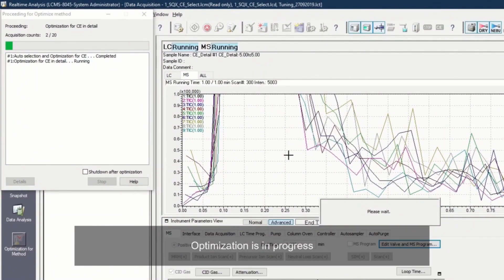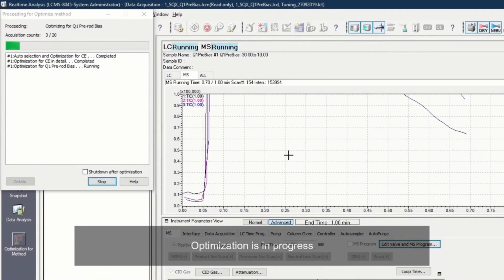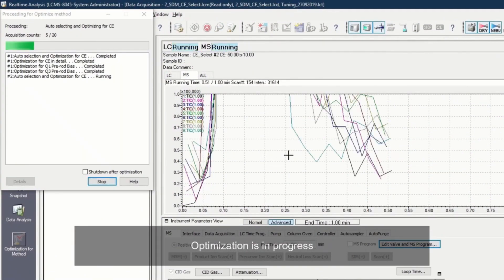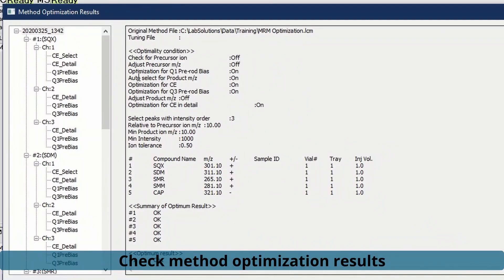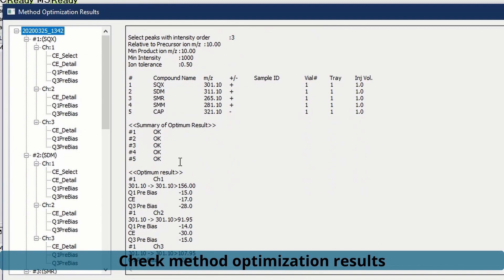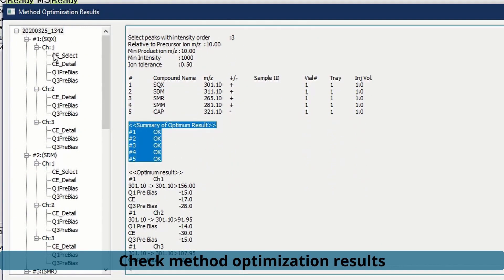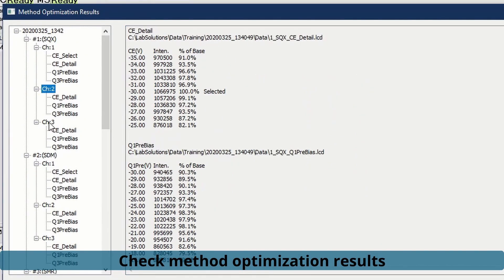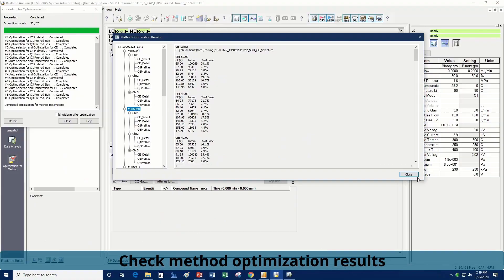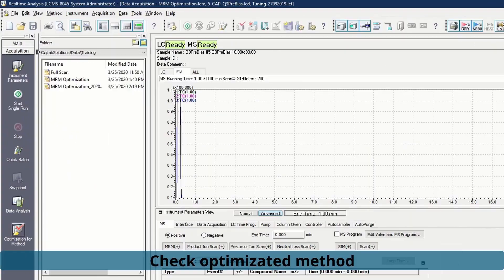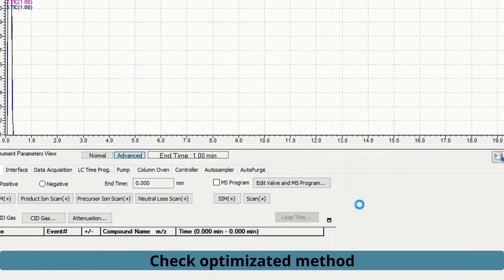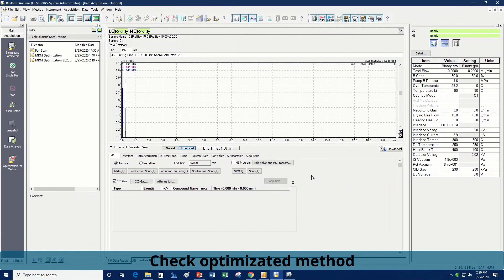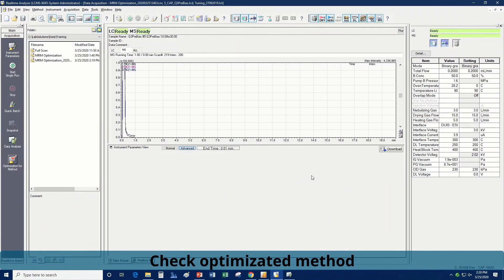During the optimization process, the optimization status will be shown on the screen. Once optimization is done, you can check the result details by pressing the Details button. The optimized results are updated in the method file automatically.